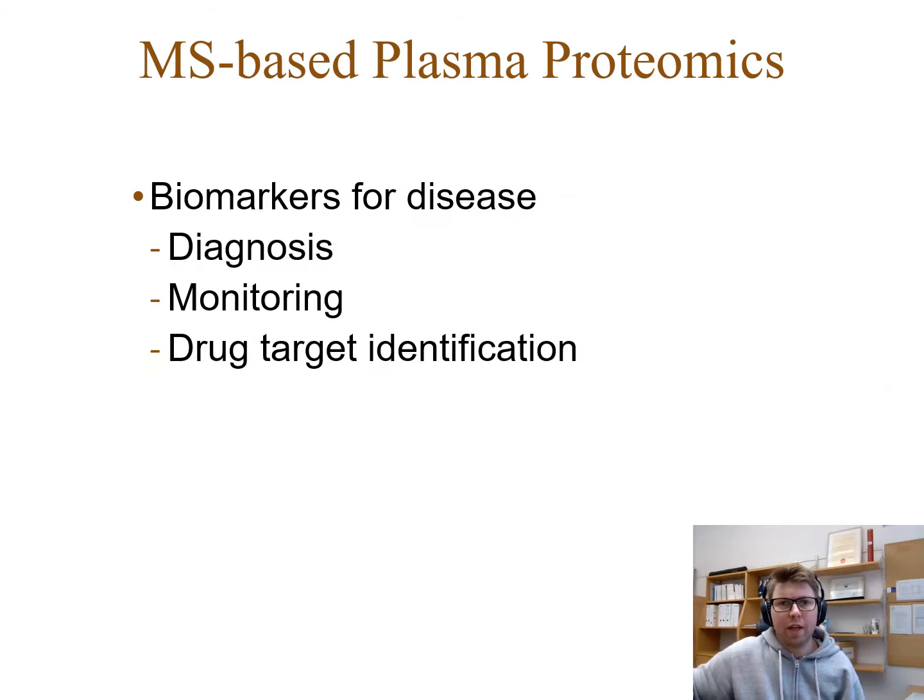So in summary, in this first example of mass spectrometry-based plasma proteomics, I highlighted how this technique can be used in biomarker studies. And these biomarkers are valuable for both disease diagnostics, but also disease progression monitoring. And these biomarkers can also represent drug targets.